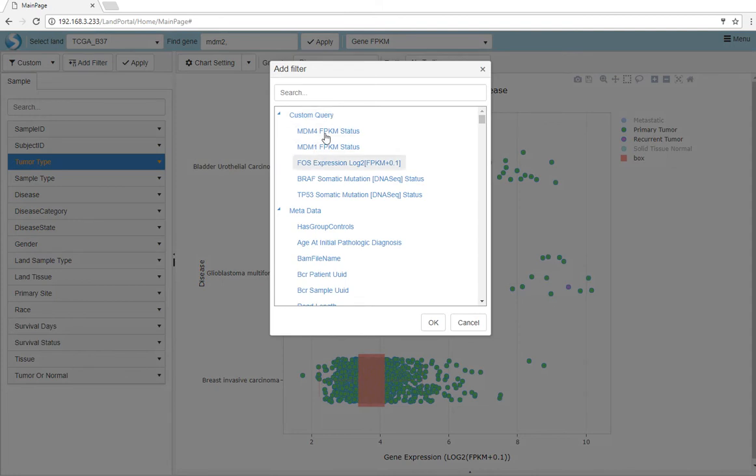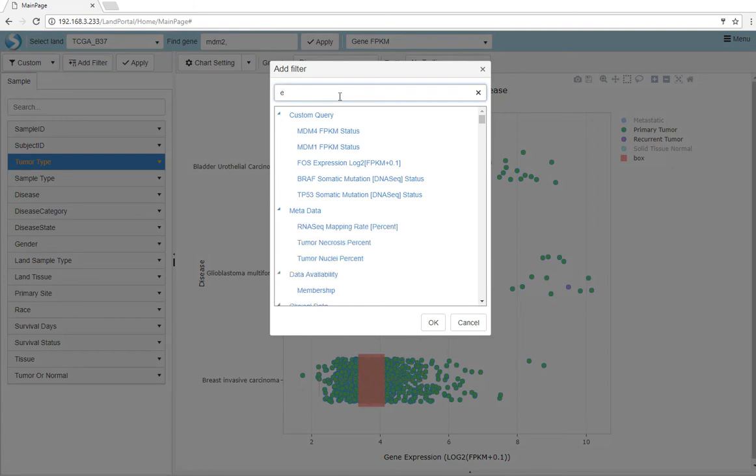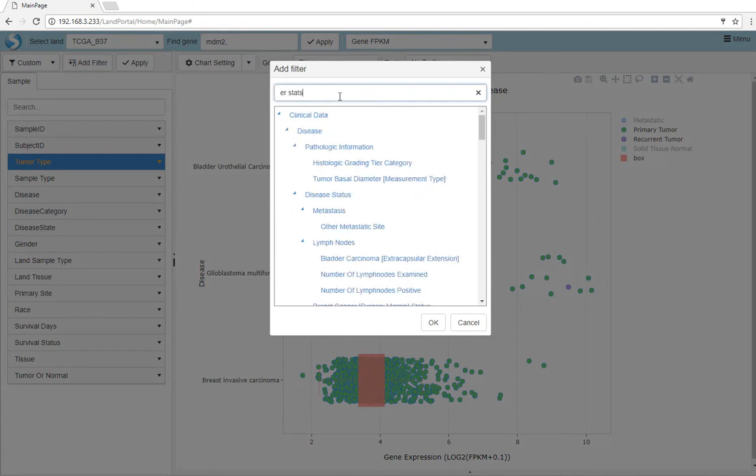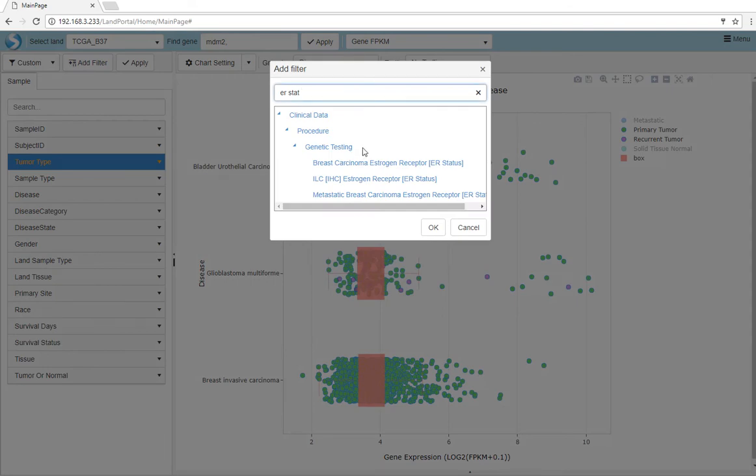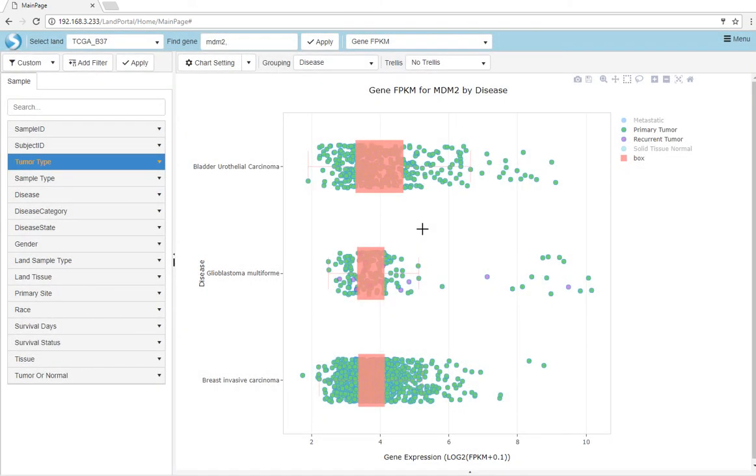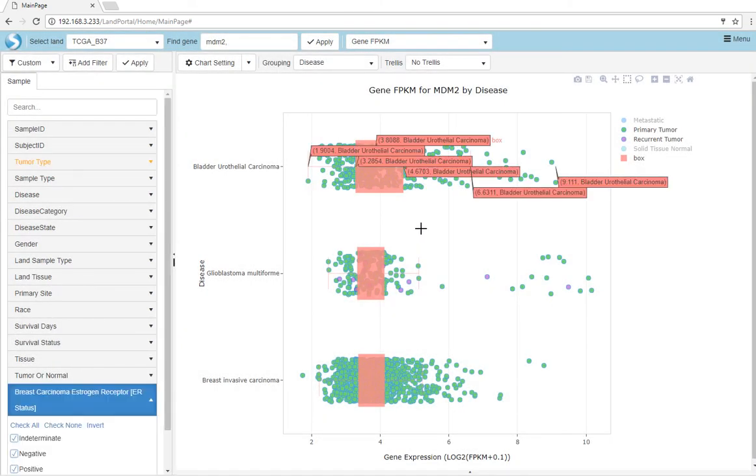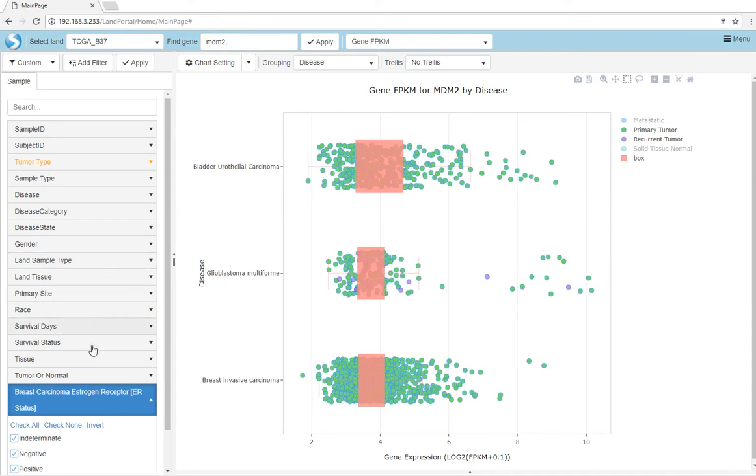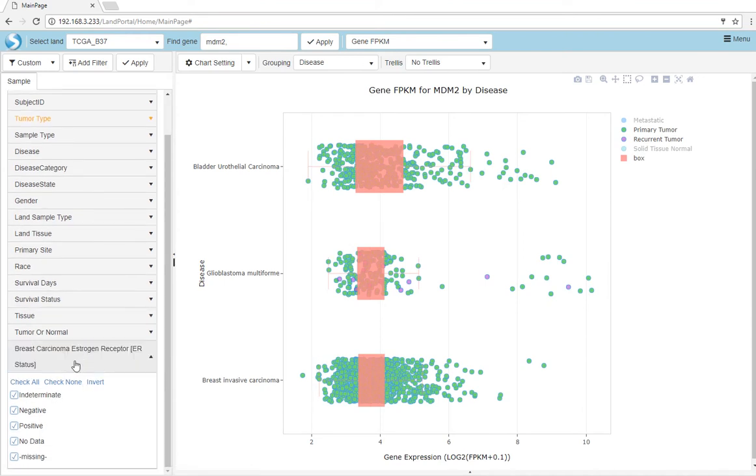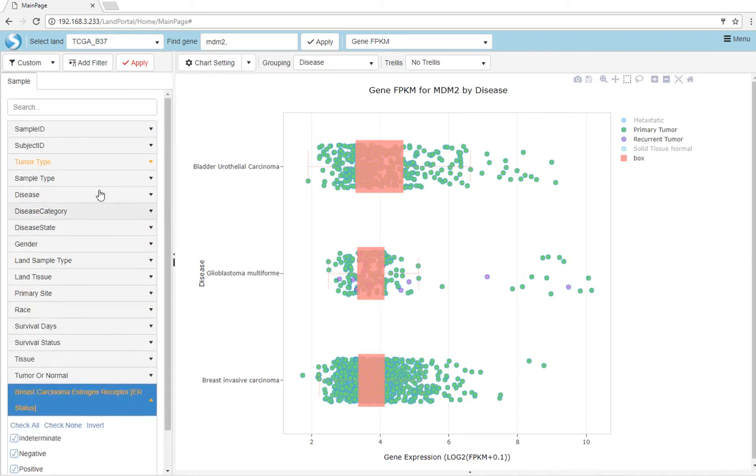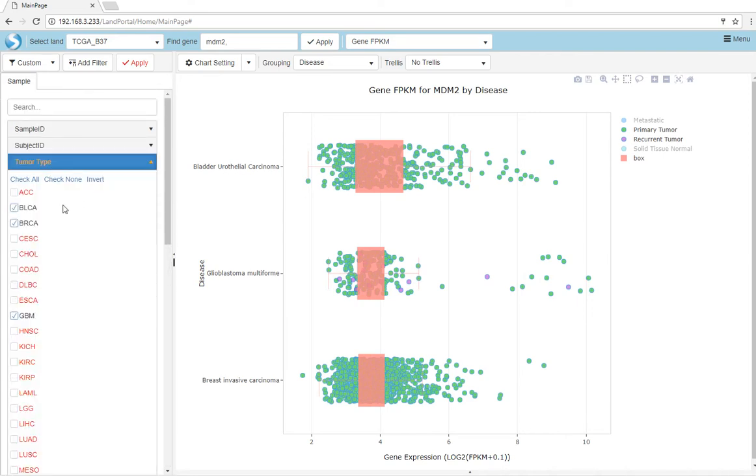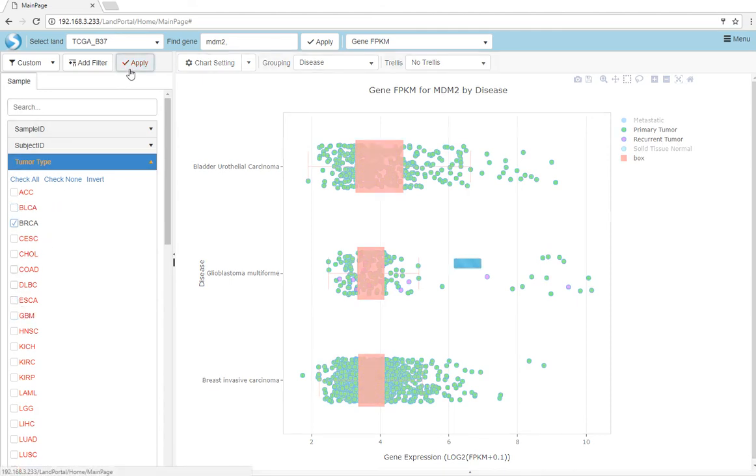For example, we can further filter for breast cancer samples using estrogen receptor status. Once this filter is added, it will be added to the view on the bottom left, and we can select for samples that have ER status data. Let's also filter for only breast cancer samples and apply this filter.